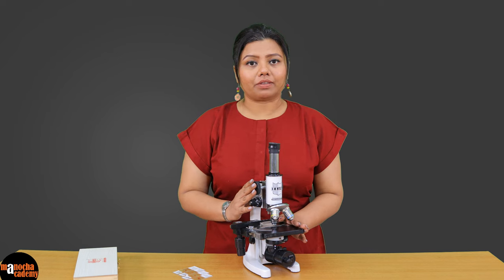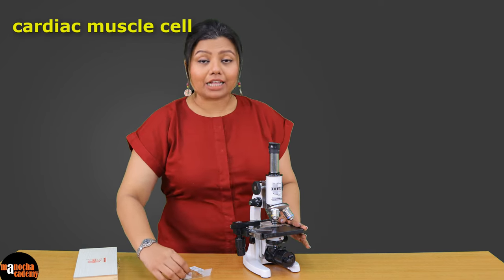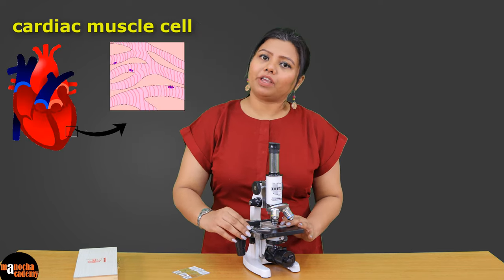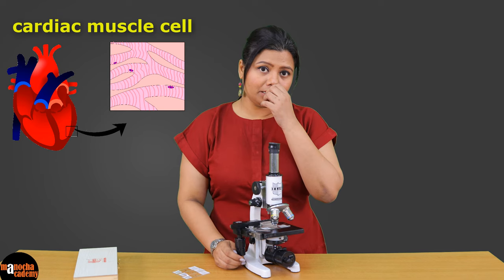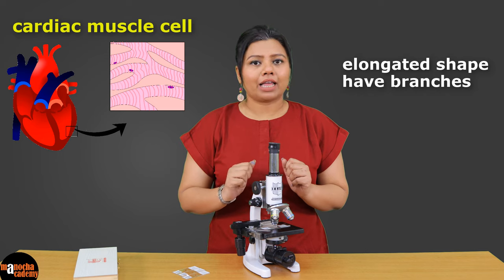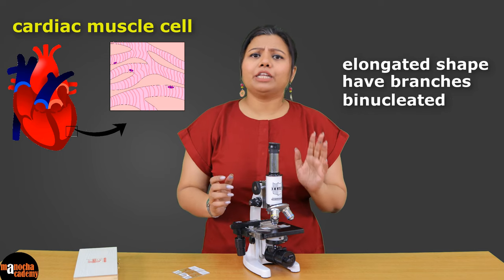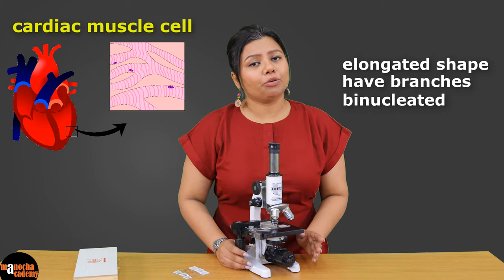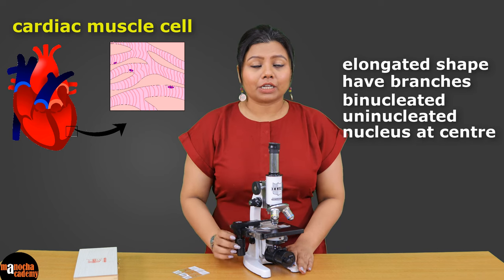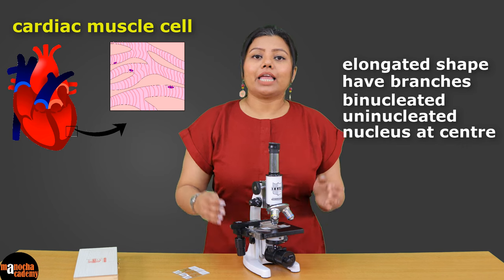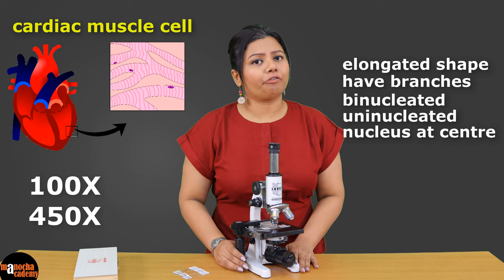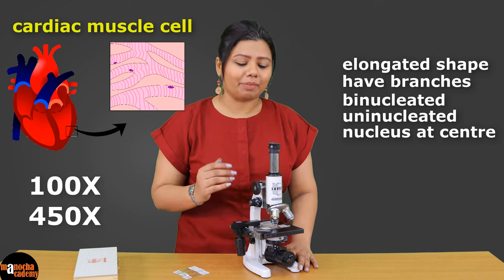Let us start with the cardiac muscle. As you all must remember, cardiac muscles are present in the wall of the heart. These are muscles which are elongated in shape, they have branchings, and they are usually binucleated. They may be uninucleated also and the nucleus is located at the center. Let us see how it looks at 100x or 450x magnification.